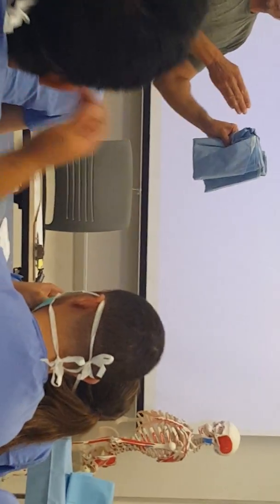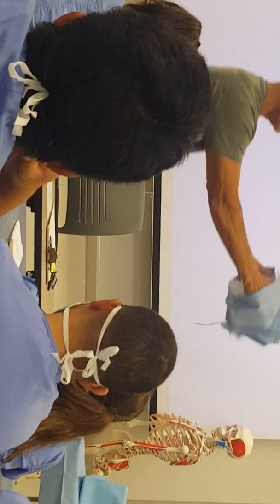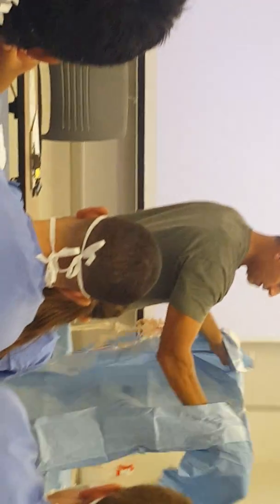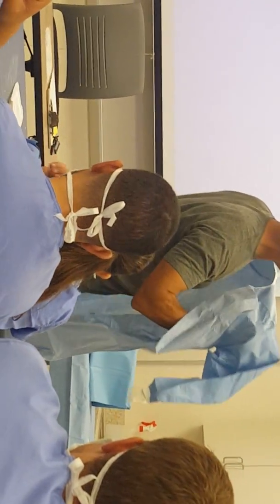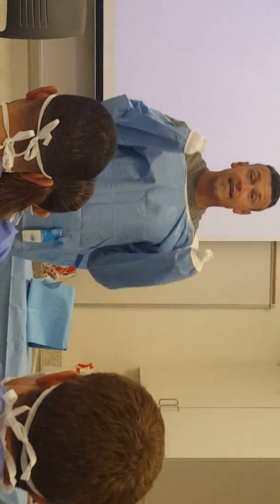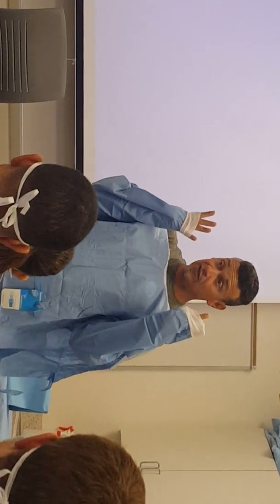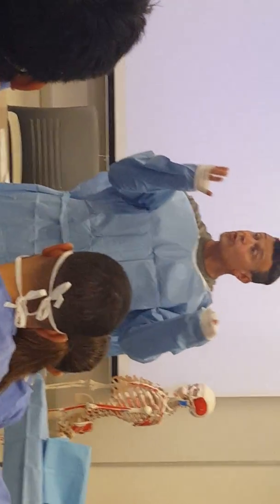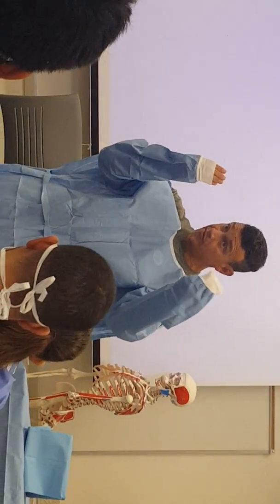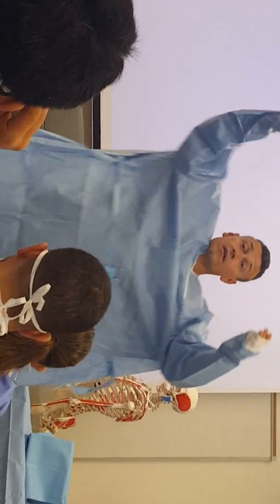Again, now the way that this is folded, I can touch this. Put my hand inside the cuffs. It's folded in a way where it unfolds and allows me to get my hands in here. I cannot stick my hands through if I'm gowning and gloving myself. If someone's going to gown and glove me, I can stick my fingers through. Got it? So you have to know when to do this and when not to do this.